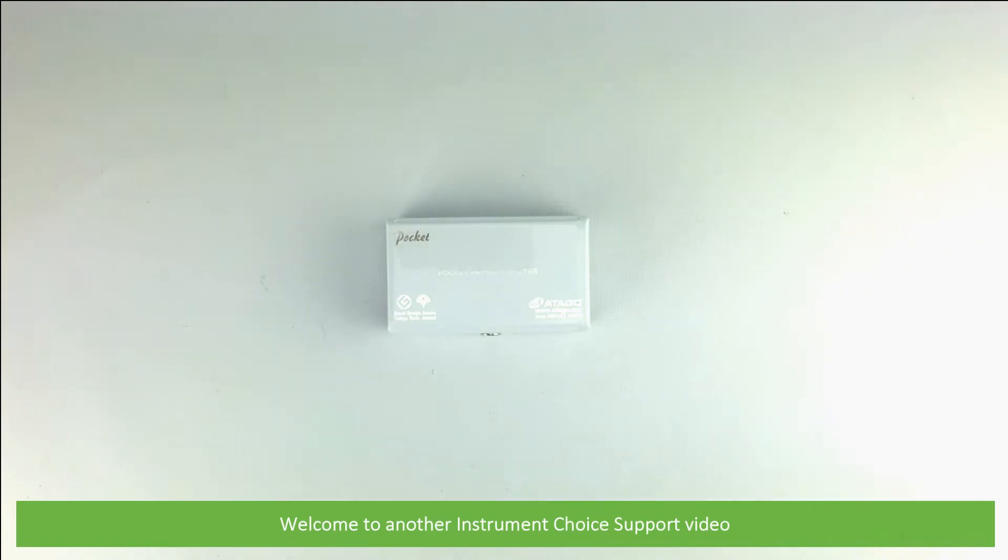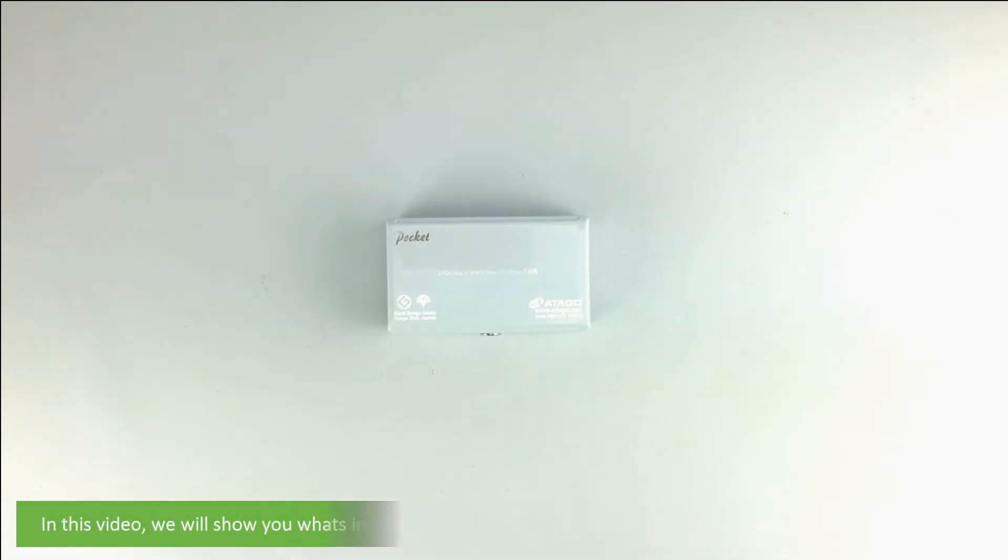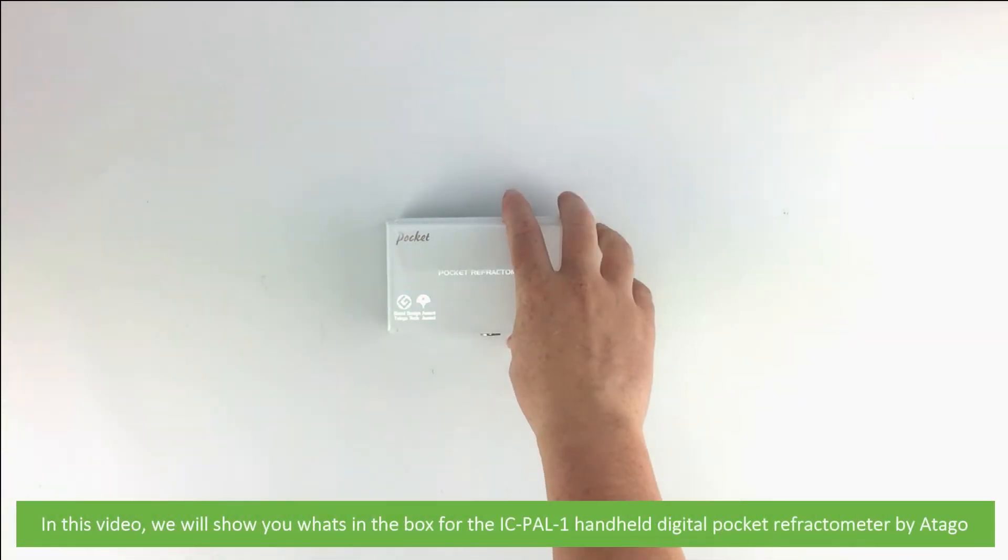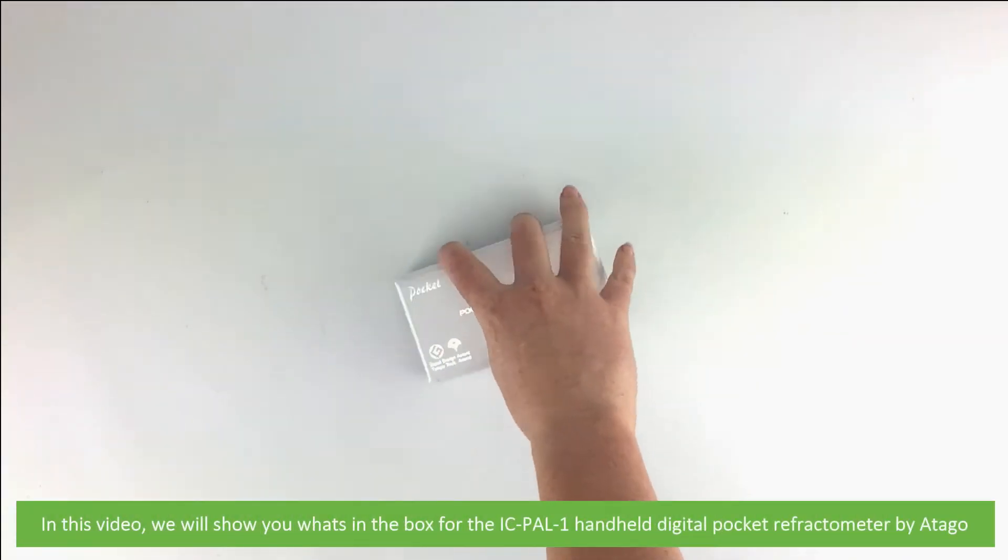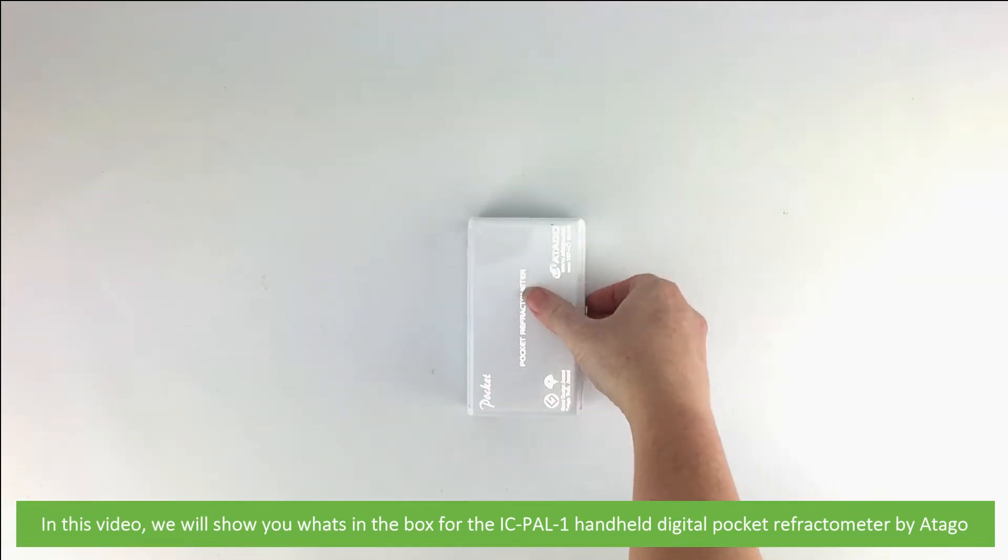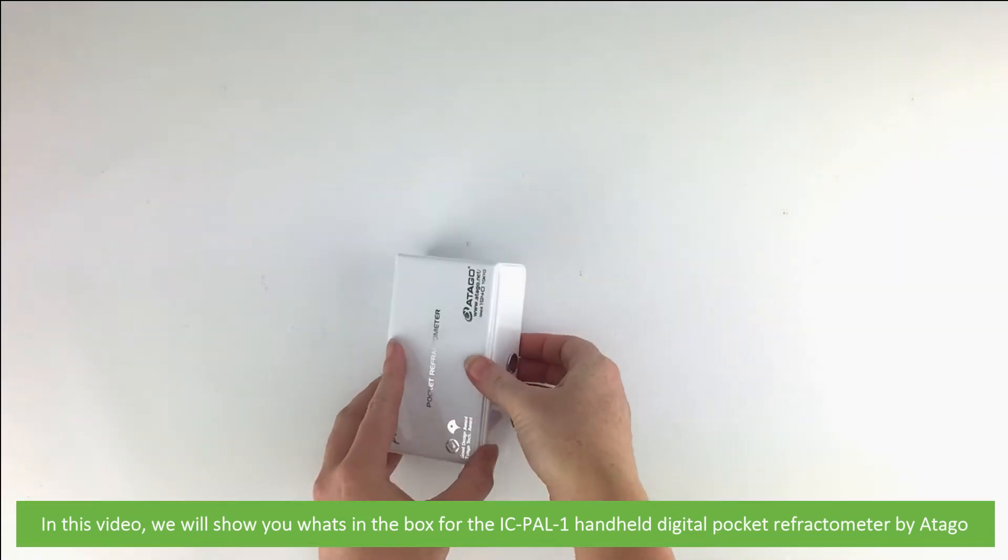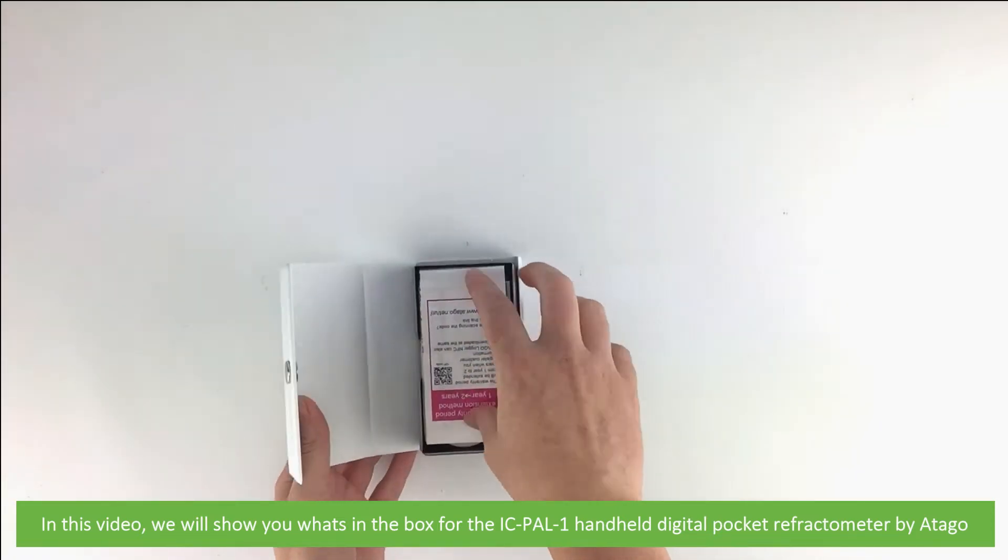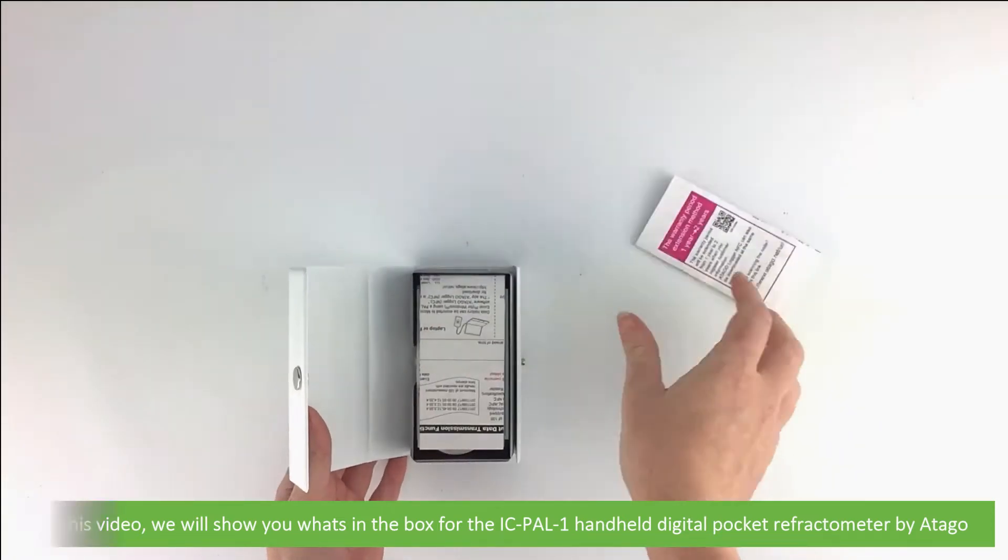Hi and welcome to another Instrument Choice support video. In this video we will show you what's in the box for the IC PAL-1 handheld digital pocket refractometer by Atago.